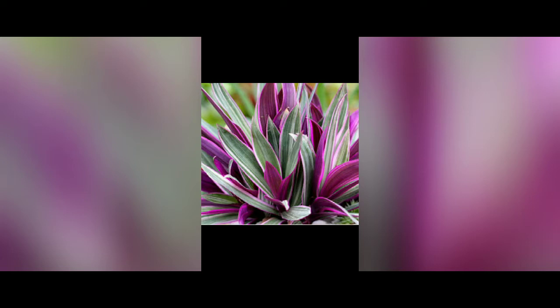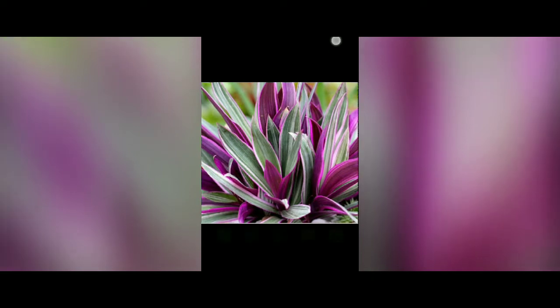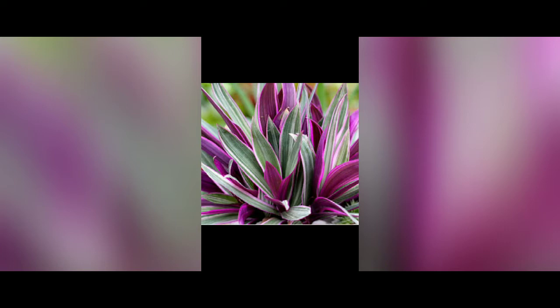It means that whatever the cell sap is there, whatever the cell's cytoplasm is there, it is colored. So you can easily observe plasmolysis. You can easily observe the shrinkage of the cell sap under the microscope. But as I did not find such leaves nearby my area, I am showing you plasmolysis in onion cells. Getting it, dear students?